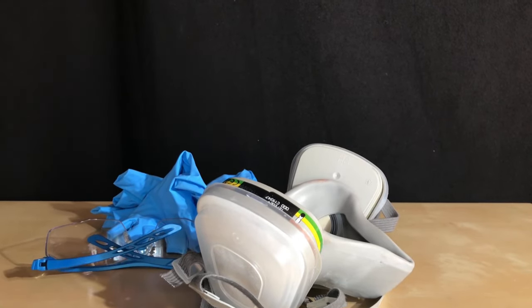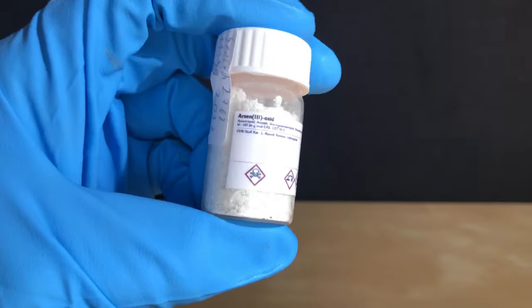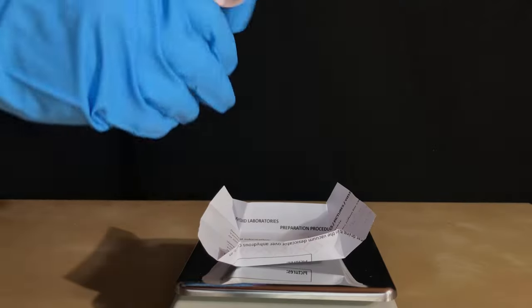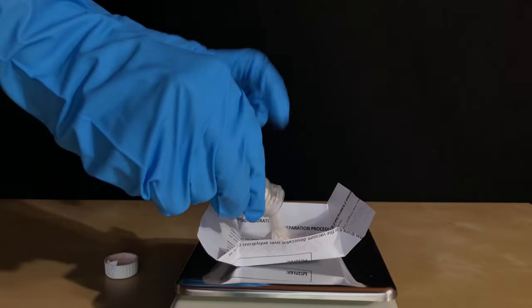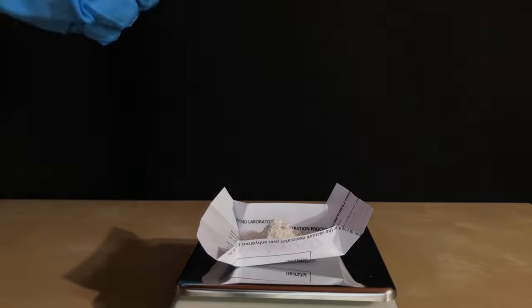For our own safety, safety goggles, gloves, and respirator were worn. I don't know if I actually still have 14.8 grams of arsenic 3 oxide, so this reagent is going to be weighed out first. The respirator was already worn during the weighing step because our arsenic 3 oxide is a very fine powder which you definitely don't want to inhale.